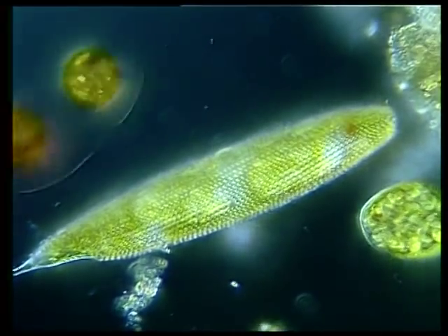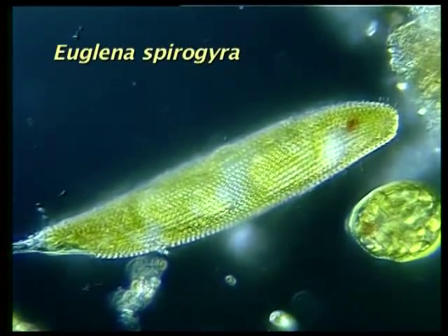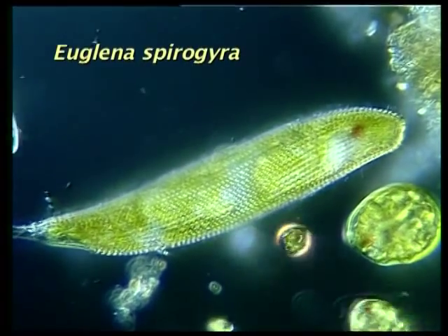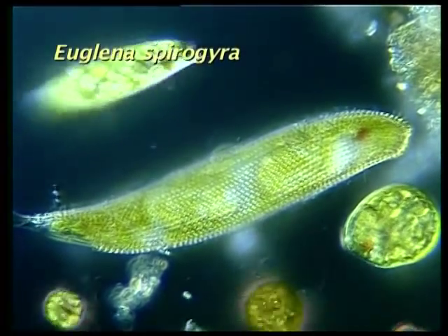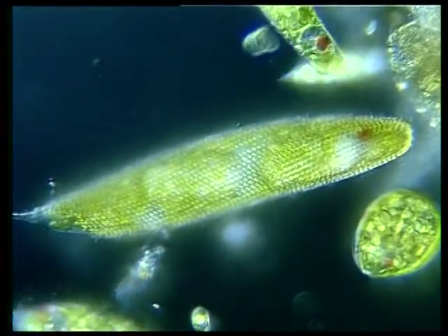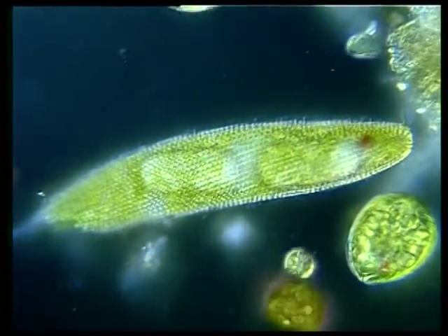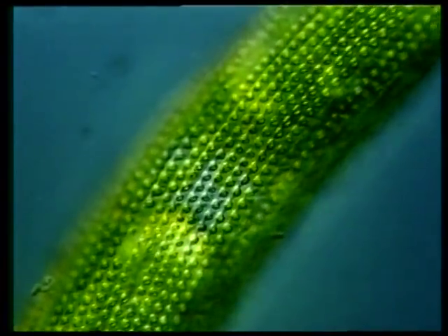In large flexible species whose pellicula strips are decorated with a row of warts, the movement of the warts relative to each other reveals how the strips slide during metaboli.